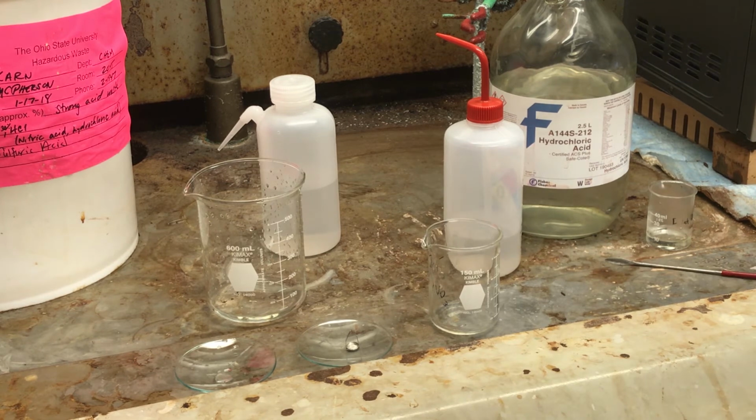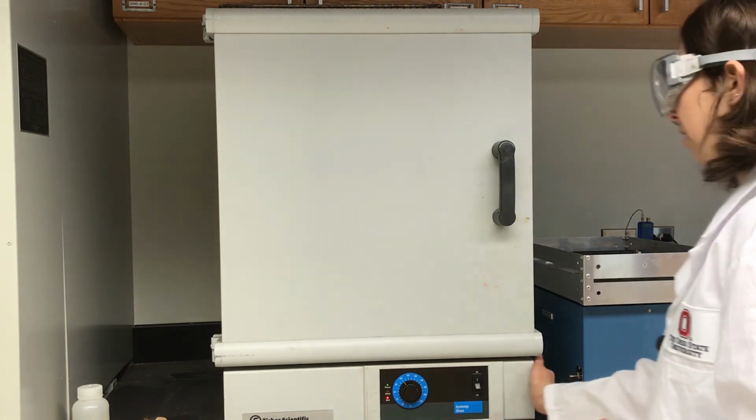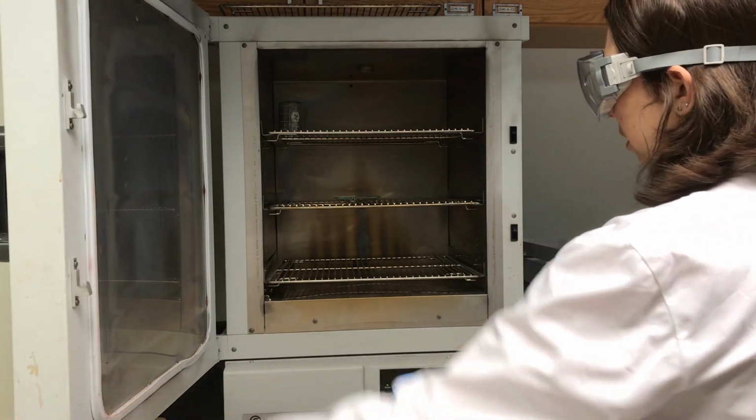All right. Now our sample pan is clean, but we need to make sure it's very dry before we use it for a sample. And so what we're going to do next is place the sample pan in an oven. So this is the oven that we're going to use for drying our sample pan. It's located right next to the hood that you've just cleaned your pan in. So to open the oven, you actually have to put your hand at the bottom of the oven and give it a good yank.